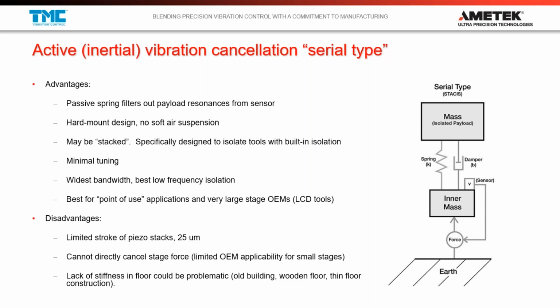It'll be a rubber elastic isolator as opposed to something extremely soft like a pneumatic isolator. Our spring is supporting our payload. And then we introduce a new component we call the inner mass, which is going to be a very stiff, high frequency structure. It's on this stiff, high frequency structure that we're going to place our sensor. And our sensor is going to have our feedback loop, and it's going to feed back into our force actuators. In this case, our force actuators are piezoelectric stacks.